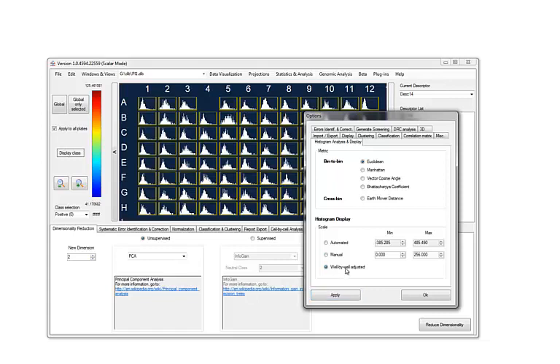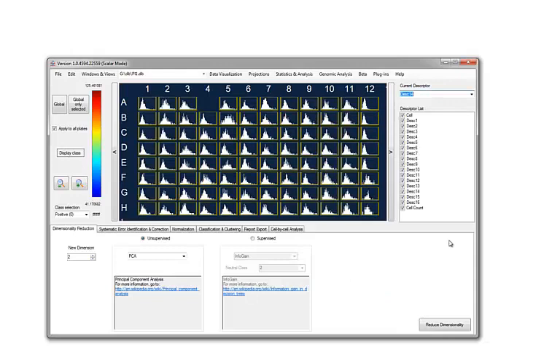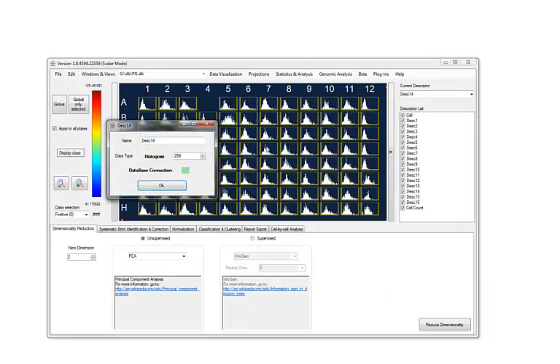There's also another way, which is well by well adjust. It means that in this case, well by well, the minimum and the maximum value will be taken into account to display those histograms. So let's keep it, for example, on manual. Let's press apply and OK. And let's move to histogram information.